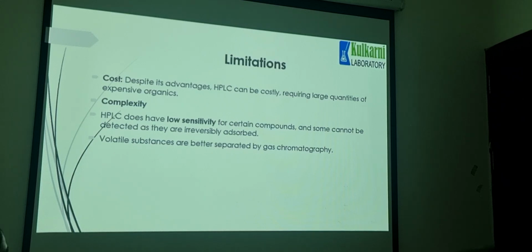Then complexity. HPLC does have low sensitivity for certain compounds and some cannot be detected as they are irreversibly adsorbed. Some compounds cannot be detected on HPLC because they are irreversibly adsorbed, or they will get adsorbed on a particular stationary phase. That too irreversibly adsorbed.